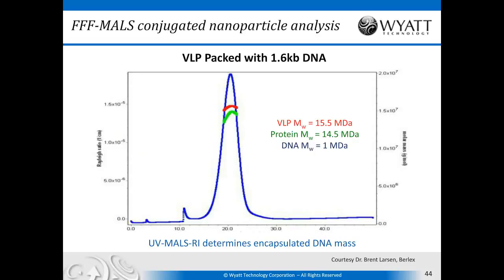And here we've looked at a VLP which was packed with some DNA using that conjugate analysis algorithm with 3 detectors to determine the molecular weight of the DNA, of the protein, and finally of the entire VLP. So you can characterize very well the encapsulated DNA mass.